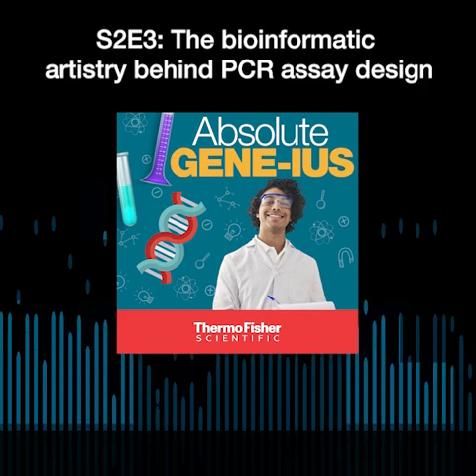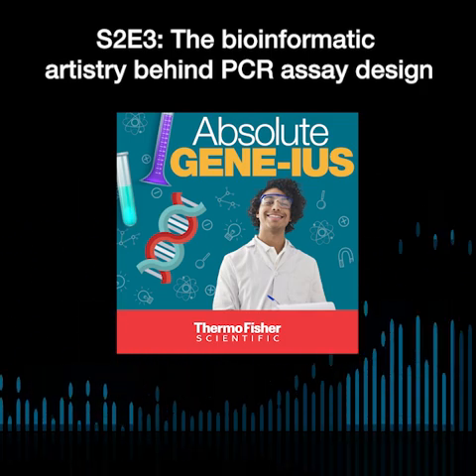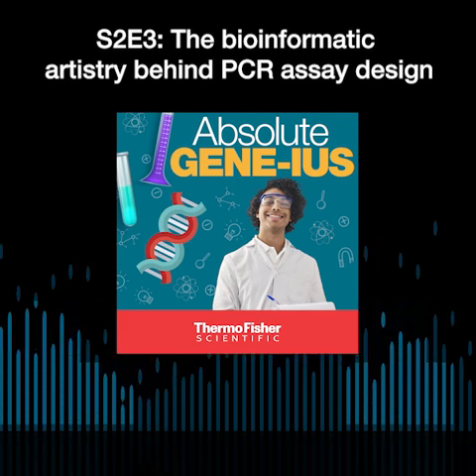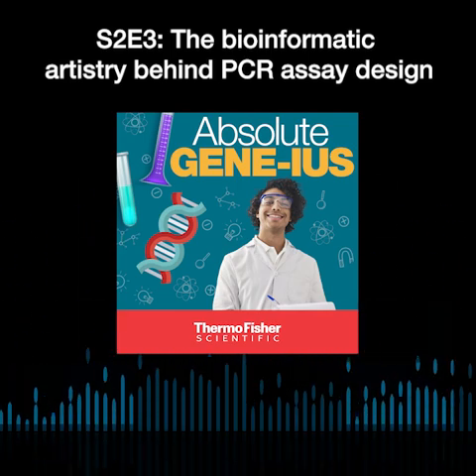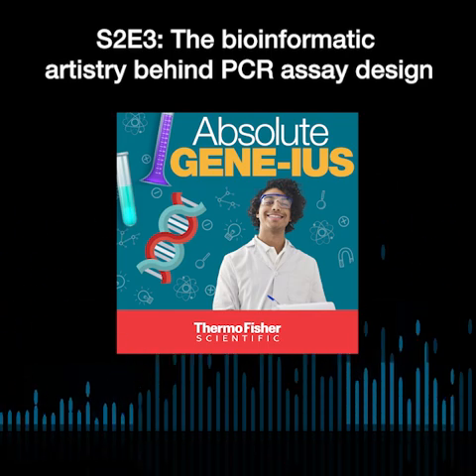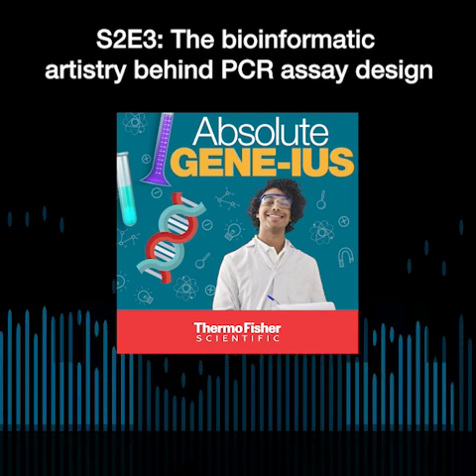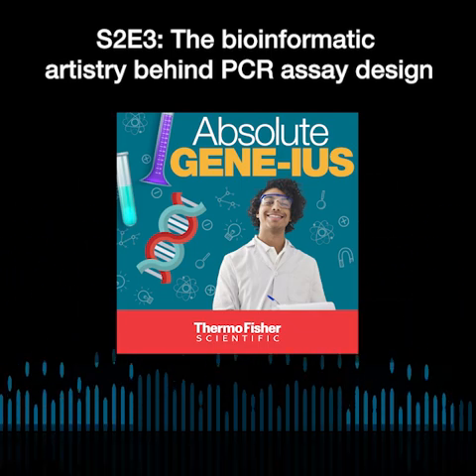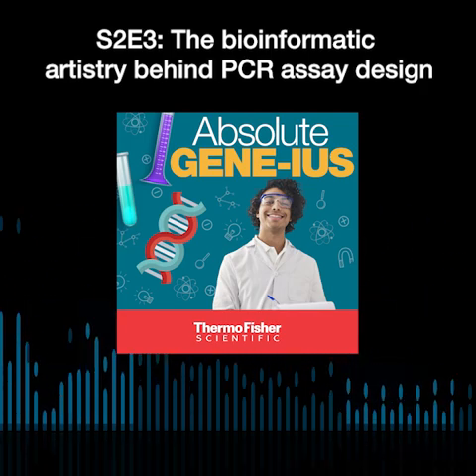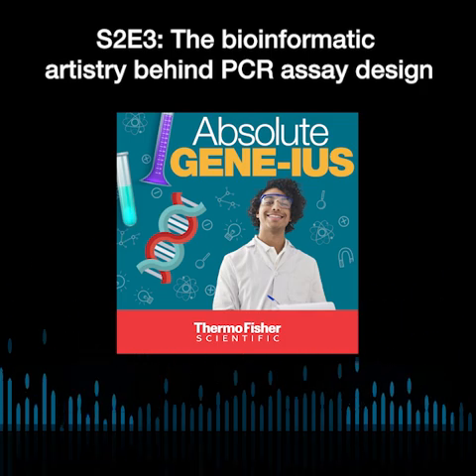So first of all, when we are actually designing the primers and probes, we like to see if we are avoiding any natural, population-wide variation. And after that, we try to make sure that our primers and probes do not form primer dimers amongst themselves and within themselves also.